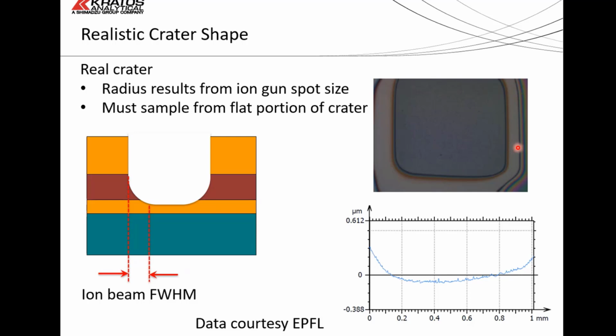So they obviously set their ion beam to raster across that whole image, but the actual realizable bottom of the crater is obviously smaller than that image. And below that, they've recorded some AFM data of this crater bottom here. So you can quite clearly see we've got these steep sides. So across, this is 1 millimeter in total across.